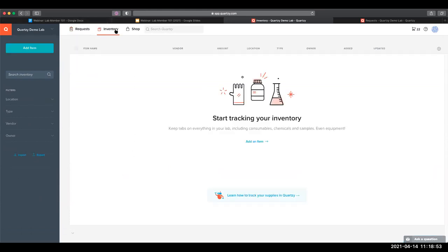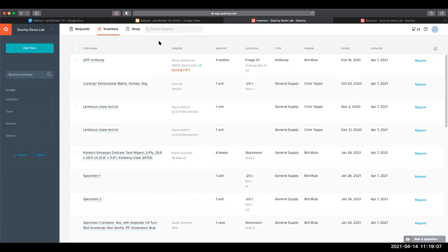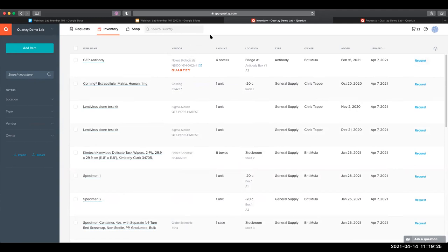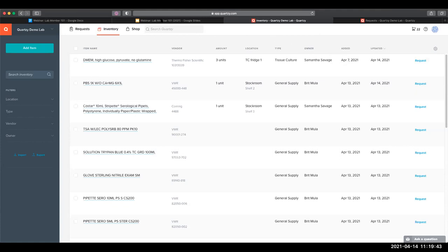And then we can go over to the inventory module to see the item that we just added. We can sort by Added or Updated — so you can sort by either of these columns to bring up the most recently added items, especially right now when we're having that indexing issue. If you go by Added or Updated, you can see the most recently added items in your inventory. Here's the item that we just marked as received.